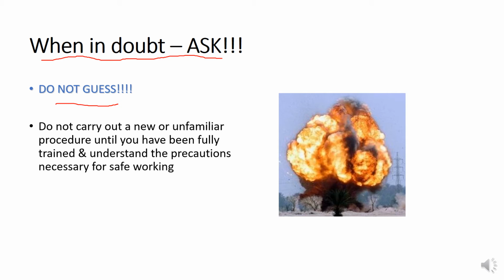Don't guess, like if I use this one it will do like this, or it will be done by experiment like this. Don't do this. This is very important. Sometimes it can cause an explosion, okay. So it is really very important to understand the properties of the chemical, the function of the chemicals.